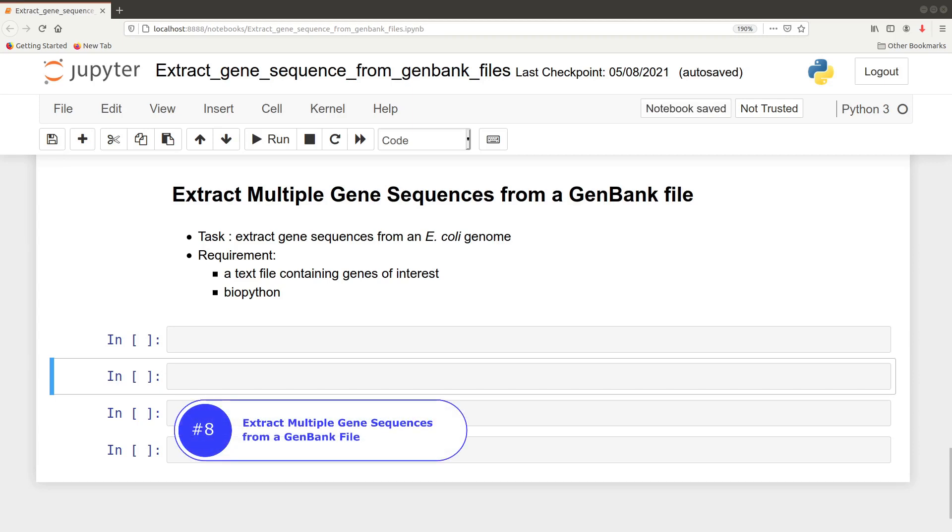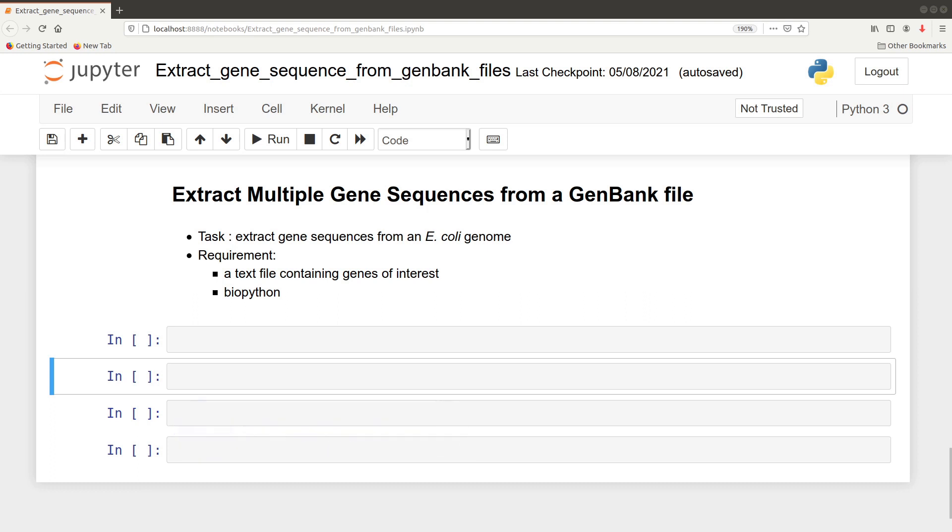Hello guys, welcome once again to another tutorial session on bioinformatics. In today's video, I'm going to show you how you can extract multiple gene sequences from a GenBank file using Python. For this particular task, we will extract the sequences for some genes from an E. coli genome.